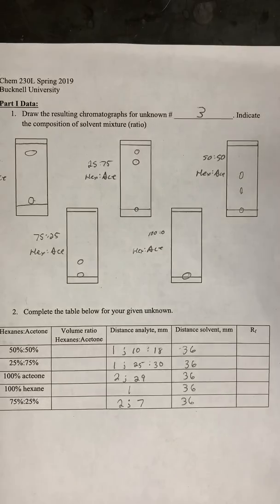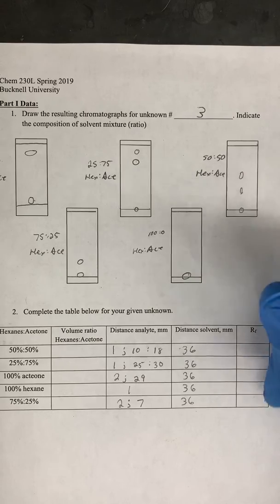So we already measured these distances in millimeters for you, and so it's up to you to fill in the RF section of this table.